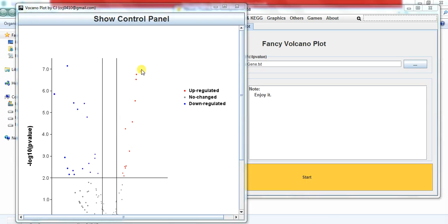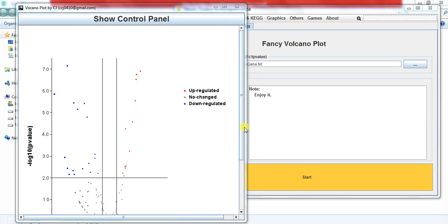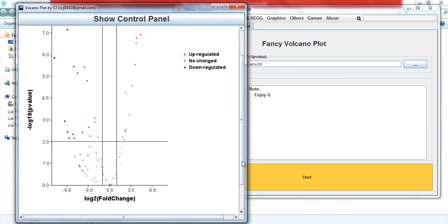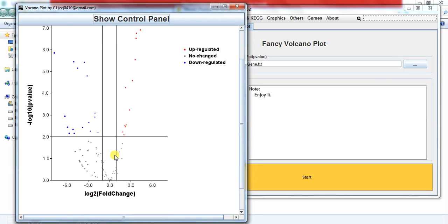Here you can see that these red dots show the upregulated genes, where these blue dots are showing the downregulated genes, and these gray genes show that these genes didn't change in response to the stress.